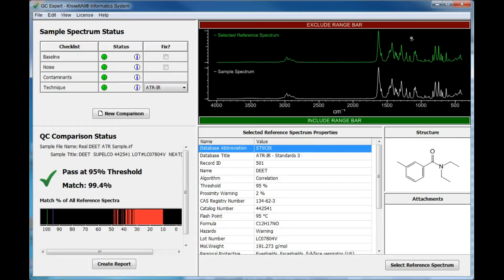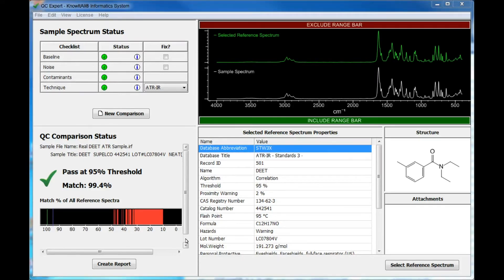Next, we'll look at the results under QC Comparison Status. The software indicates if the sample passes or fails based on the match percentage and threshold sensitivity set by the administrator. Our spectrum passes with a 99.4% match percentage.